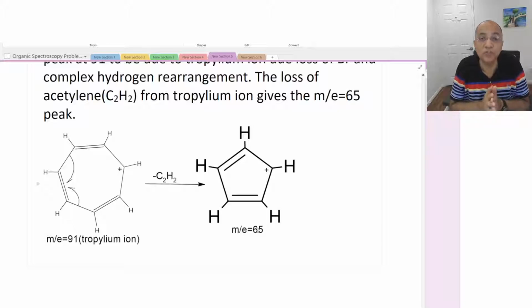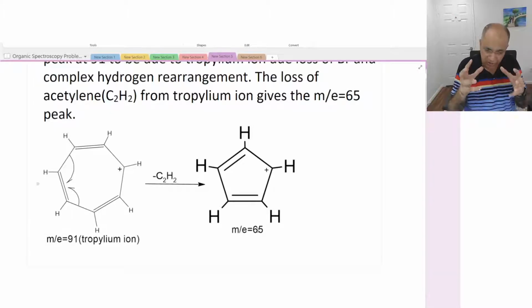So we come to the close of the conjoint problems from Silverstein, and there are two problems we have taken from 4.4. A, C, B we have just reserved for a future exercise.